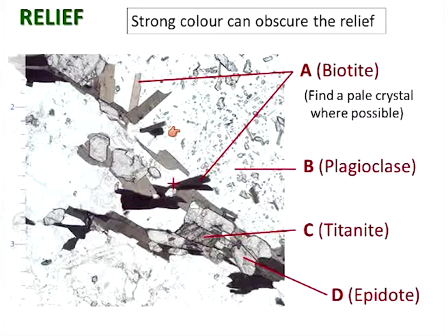And the plagioclase, this is quite a large plagioclase crystal here. In fact, this whole area here is one plagioclase crystal. But what you're seeing in there as well are tiny little bits of high relief epidote, which is part of the plagioclase alteration.